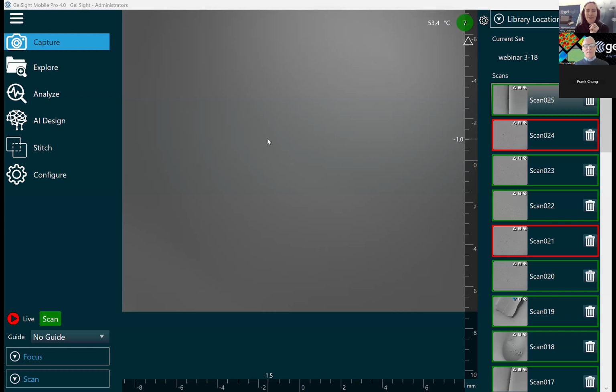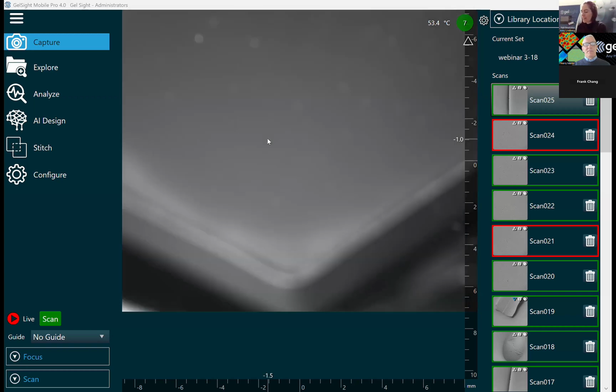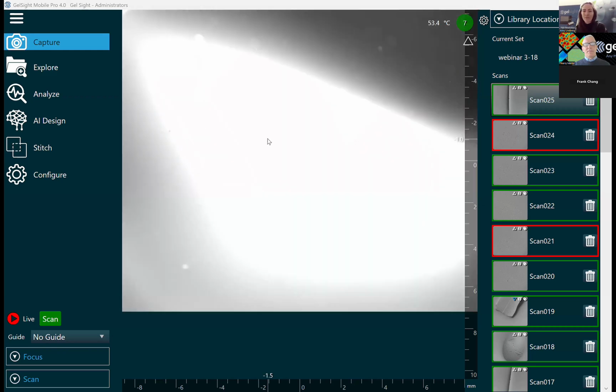To start with a little bit about how GelSight works, we have our Series 2 system here, and it has a gel sensor on the end of it. Basically we have a camera and a lens and an illumination system in here. When we click the button on the probe, we're actually taking 6 images, one with each one of these banks of LEDs illuminated. We take those 6 different images with 6 different lighting orientations to get 3D data from that.